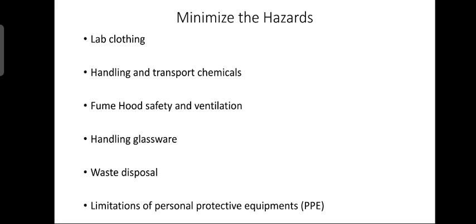Students must be aware that all laboratory research has risks and that careful planning and preparation can reduce those risks to acceptable levels. Students should prepare for emergencies by being able to explain how to respond to common emergencies that could occur in laboratories, such as fires, explosions, chemical exposures, injuries and chemical spills.